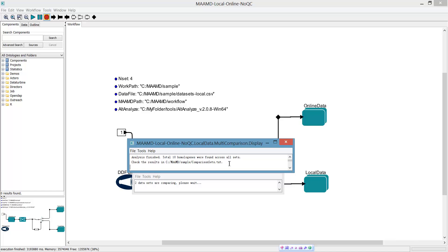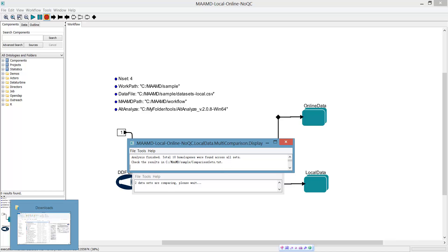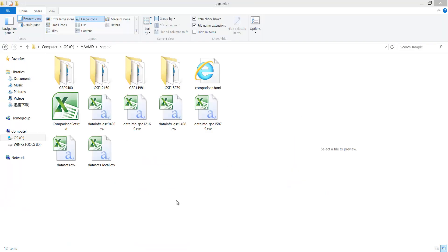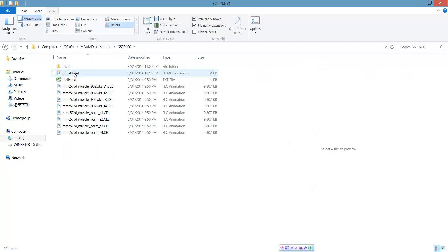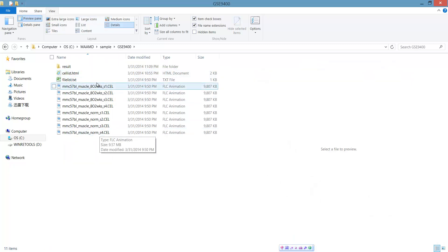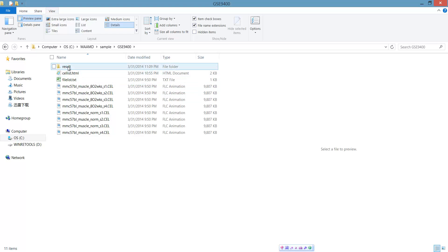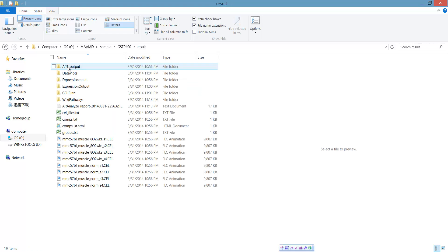Now let's have a look at the results. This is the inter-dataset analysis result. And for each dataset, you get an individual result folder. This is the raw data and the results.